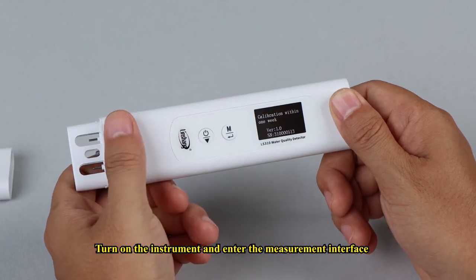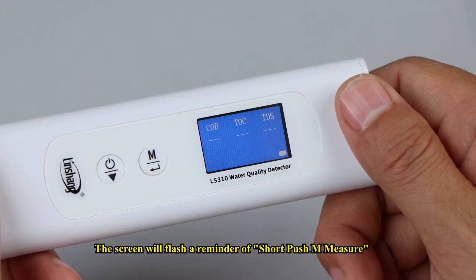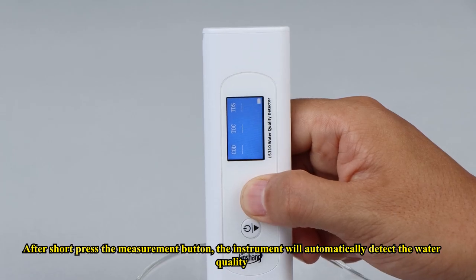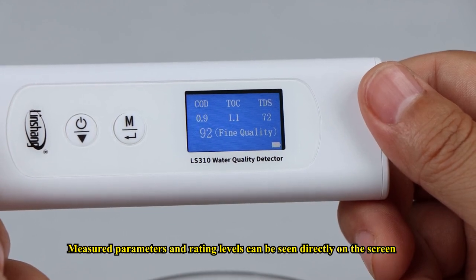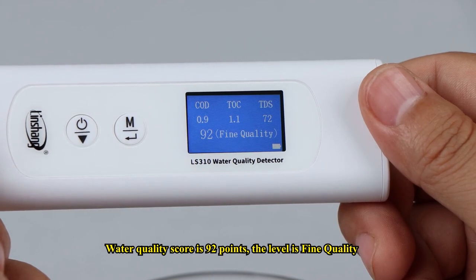Turn on the instrument and enter the measurement interface. The screen will flash a reminder to short-press M to measure. When testing, insert the probe into the water. Note that the measured liquid should exceed the minimum water level line. After short-pressing the measurement button, the instrument will automatically detect the water quality. Measured parameters and rating levels can be seen directly on the screen — for example, a water quality score of 92 points at the fine quality level.